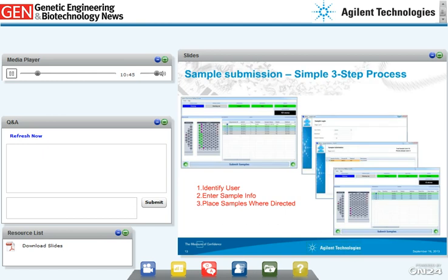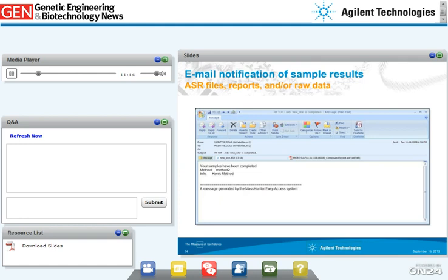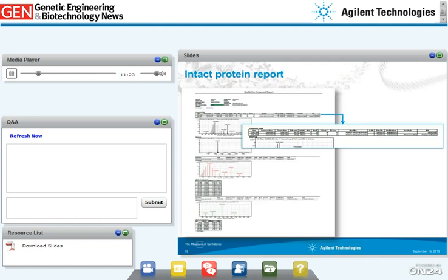This slide shows the simplified user interface on the Agilent MassHunter Biopharma Walk-Up LC-MS software. It starts with sample submission in three simple steps: the user logs into their account in step one; in step two, the user enters sample information and chooses a method from an administrator-approved list; in step three, the user places samples into the auto-sampler at locations directed by the software. Once analysis is complete, the software sends an email to the user with the report and data, including data file name, sample name, sample position, method used, and data analysis.